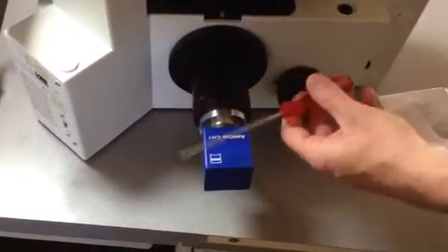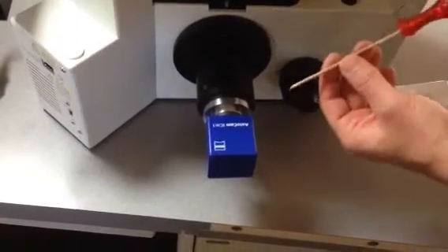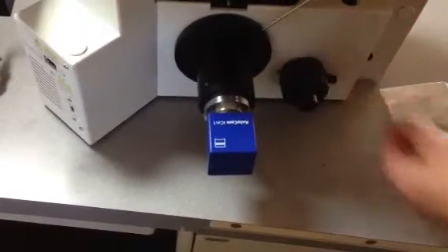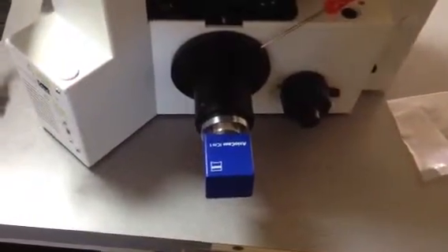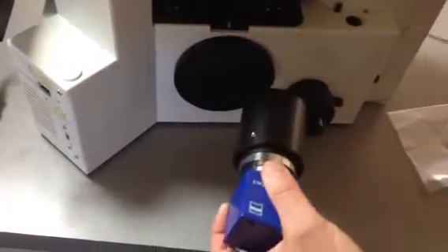This 3mm wrench came in the box with your new adapter. You're going to take the wrench and put it in this hole right here. There's a single hole with a single set screw that holds this adapter in place. You're just going to loosen this a couple turns and this whole thing comes off.